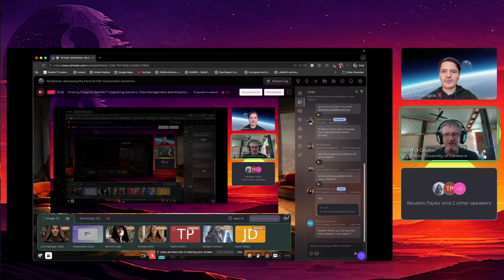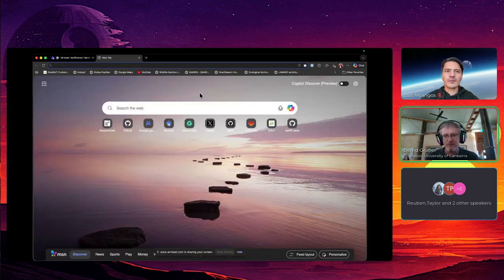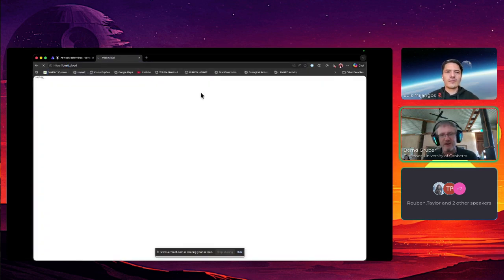And after a month or so, you will be defaulted to a normal account, which means you have only 25 hours compute time, but you can still log in, download everything, and even run it, but not more than 25 hours compute time. So there's no rush, but you can export. There's an export button, and you can download the whole session in one go. And then you only have to install all the packages, which can be a pain, I admit that, but the data and the code you have will be there.